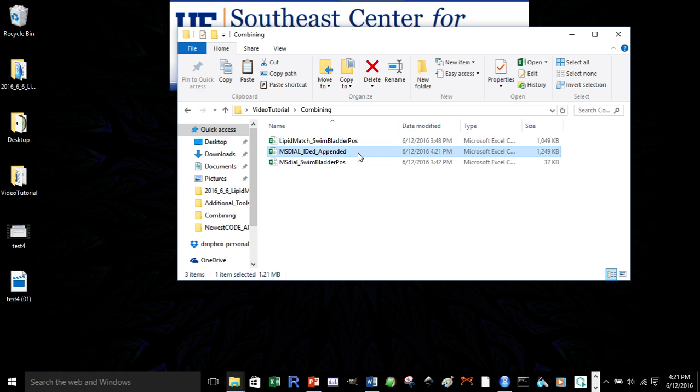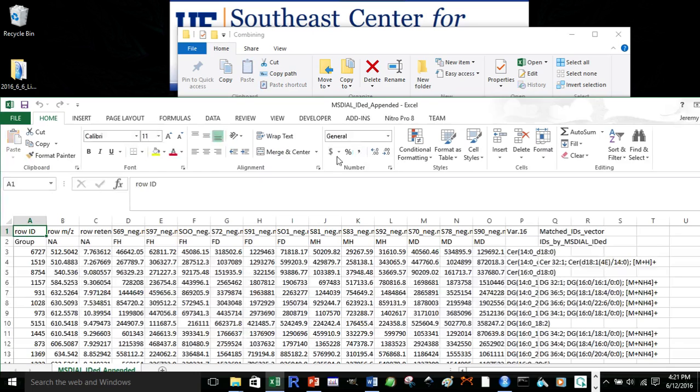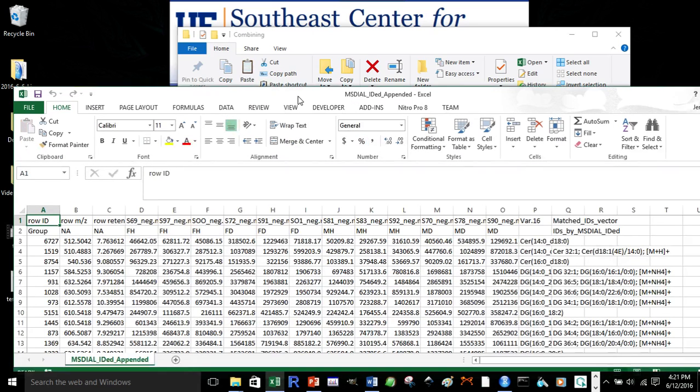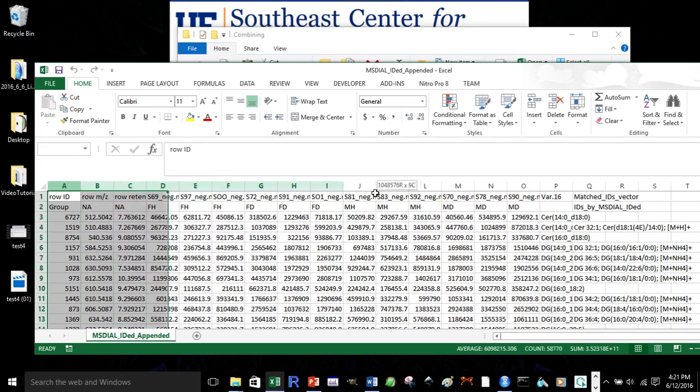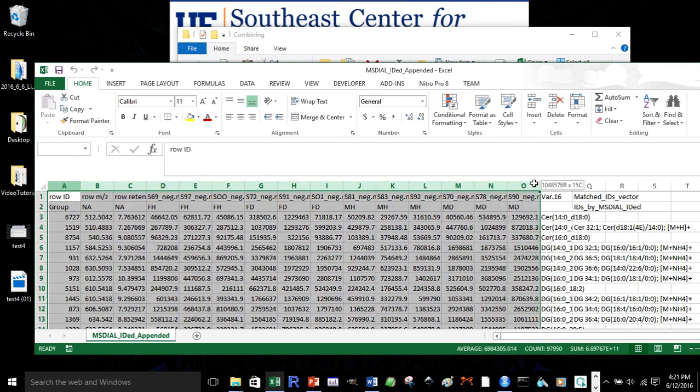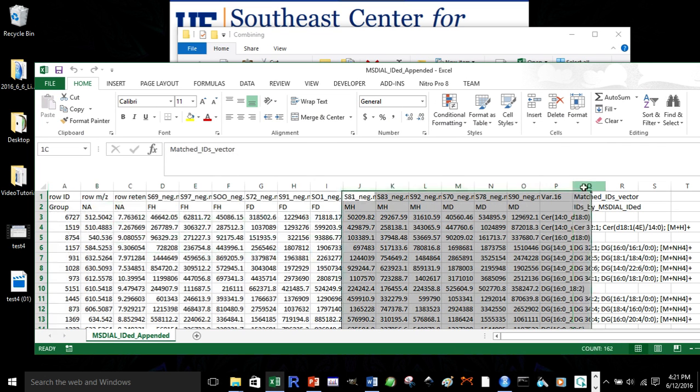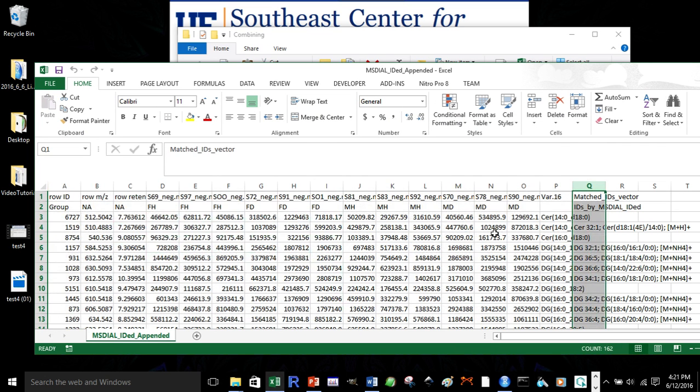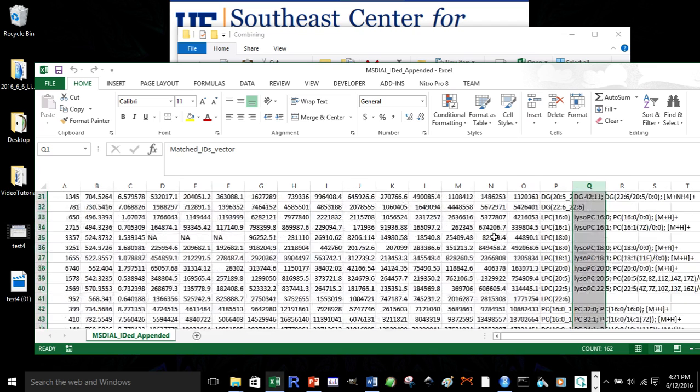So, now we have our created file. We can open it up. And now we can see that our MS dial original feature table is the same. But then, we have matched on the MS dial identification.